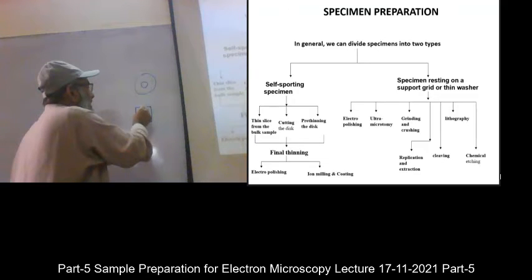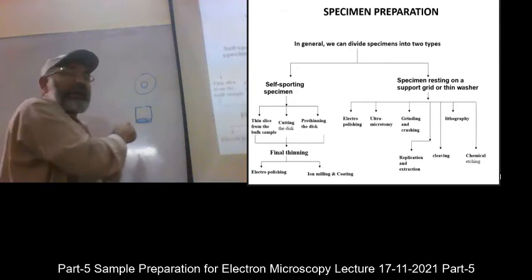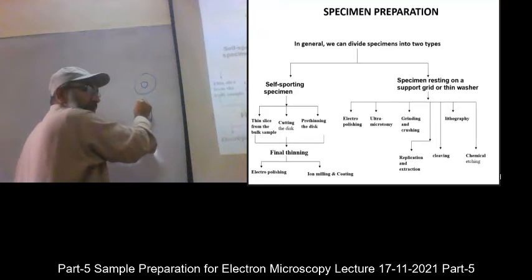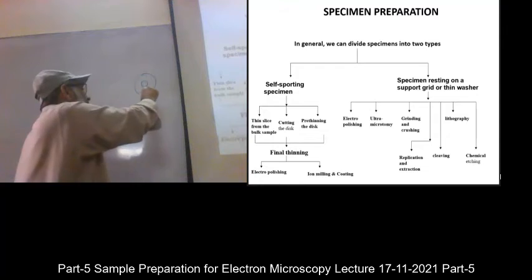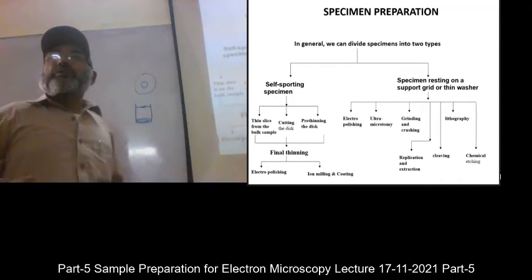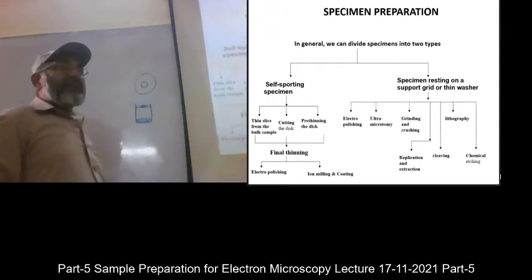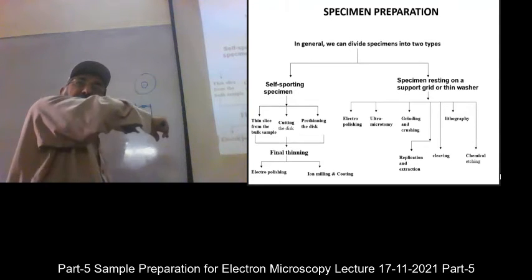Here you leave a 3 millimeter hole in the middle in the sample holder. You put the sample here, it is a little bit deep. You put the sample here and you put that top plate on it, and there are screws here. And you fix these screws so the sample is gripped like here.